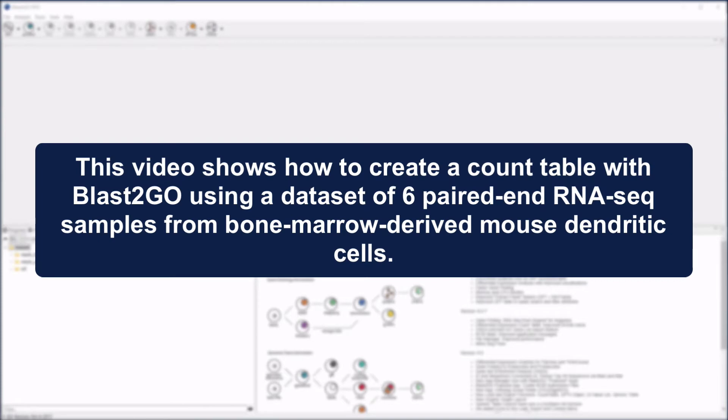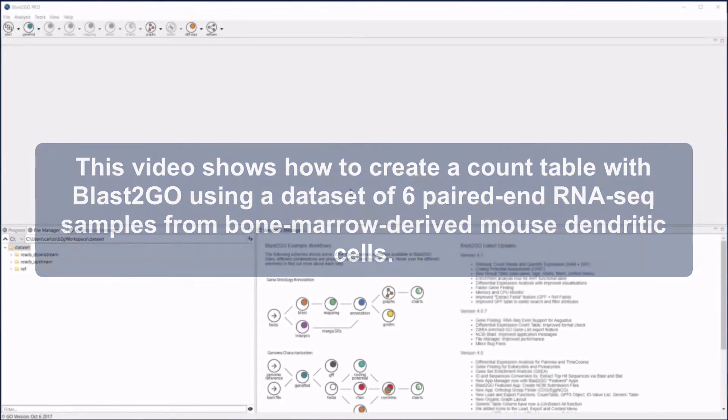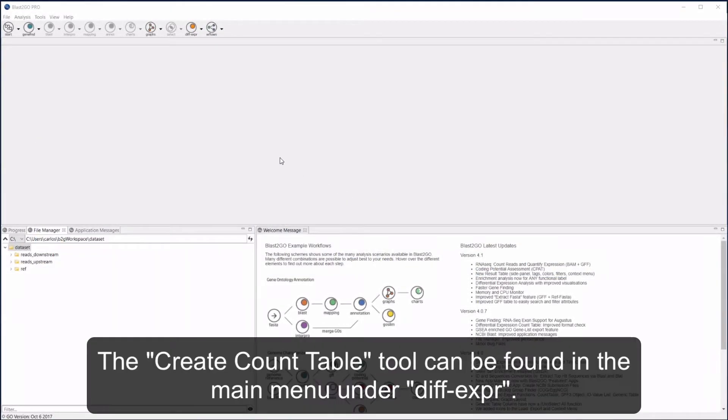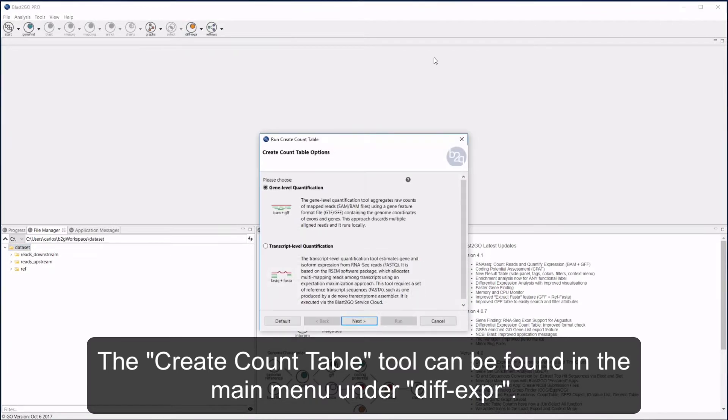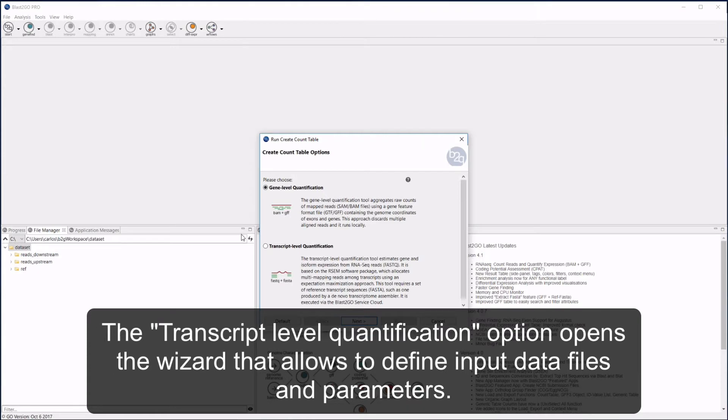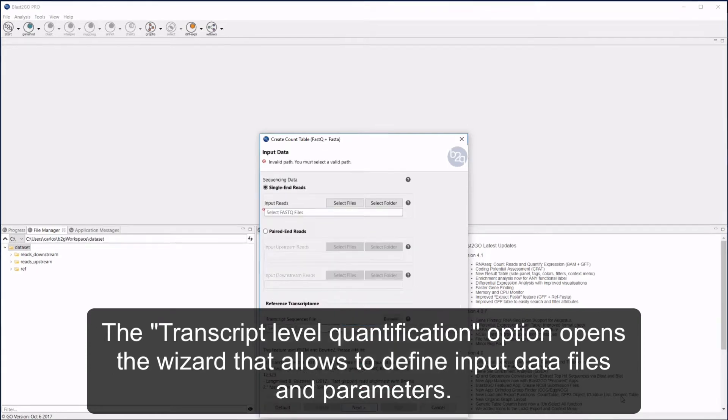This video shows how to create a count table with BLAST2GO using a dataset of six paired-end RNA-Seq samples from bone marrow-derived mouse dendritic cells. The Create Count Table tool can be found in the main menu under Differential Expression. The transcript-level quantification option opens the wizard that allows you to define input data files.